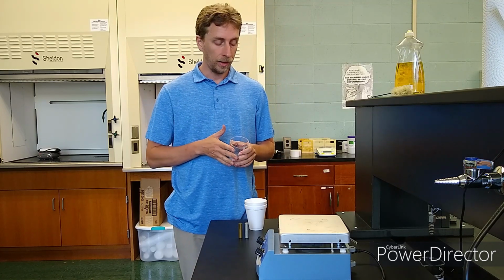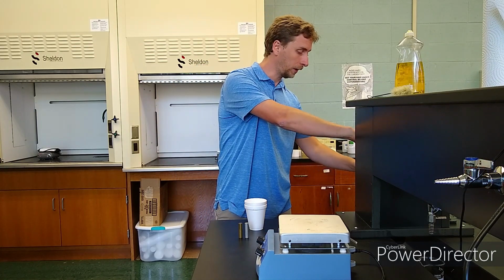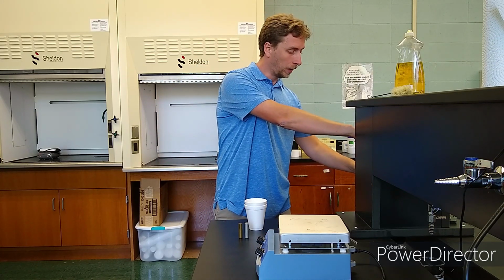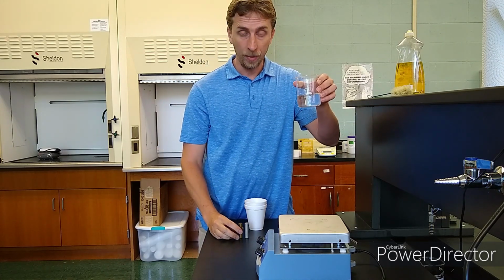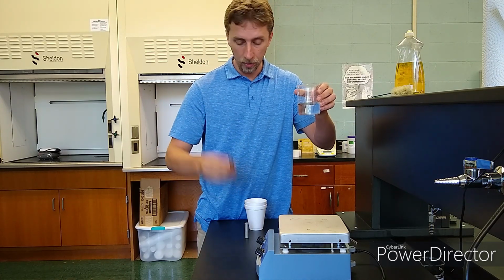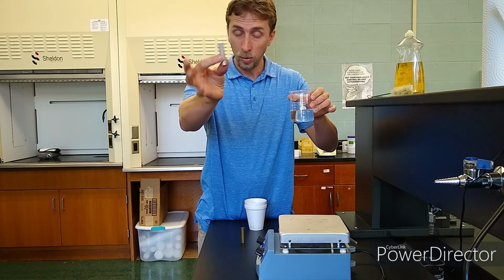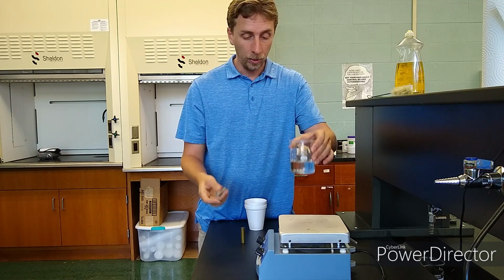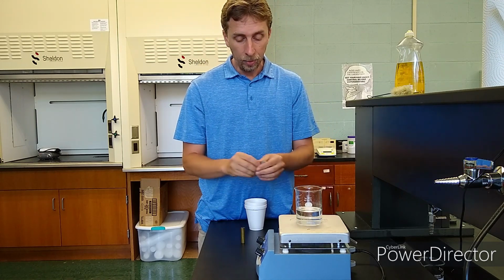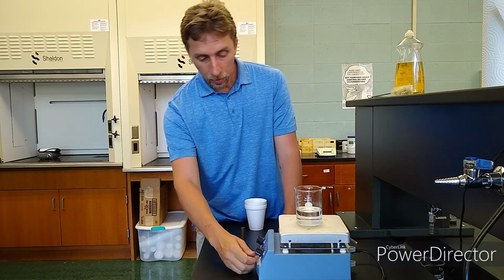First thing is a beaker of water. I've got to put the water in here. Don't need much water, just enough to submerge our sample metal. For the first metal, since I talked about it in the classroom, let's do aluminum first. This is a nice little cylinder of aluminum. I'm just going to put it on the hot plate here, and I'm going to turn the hot plate up onto high. There we go.